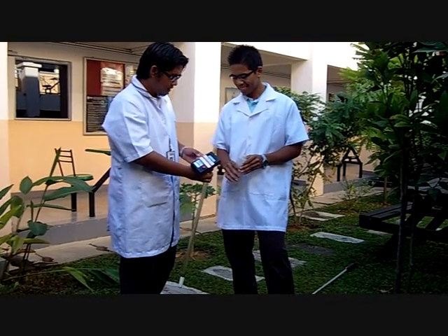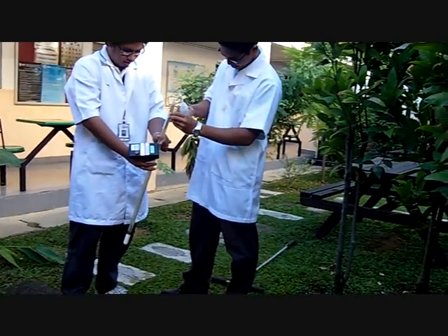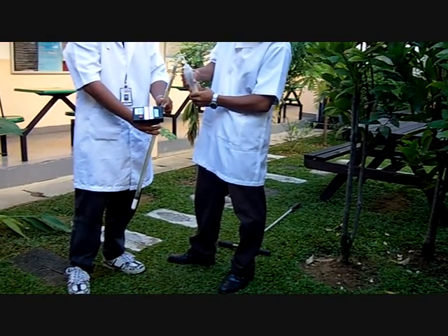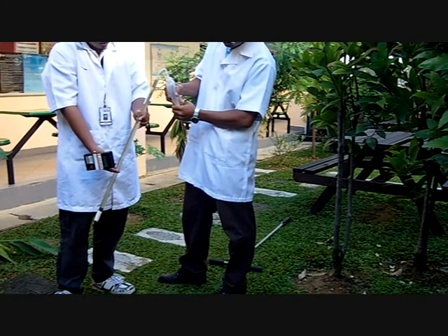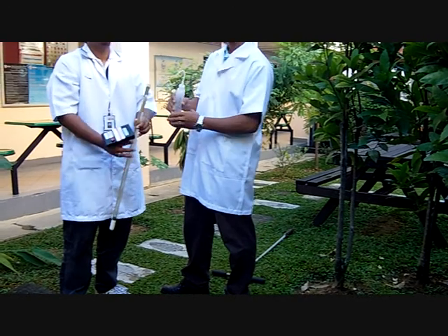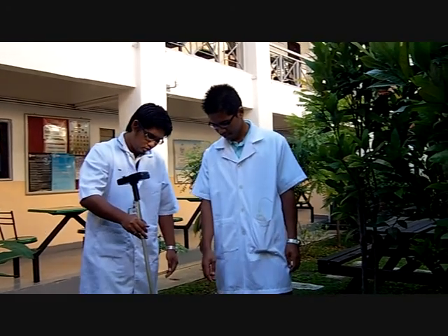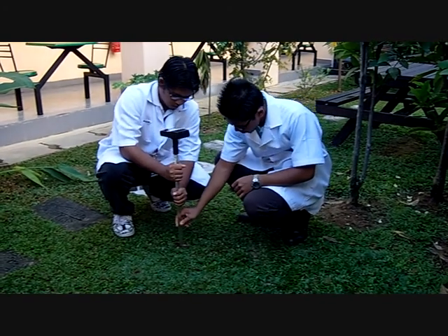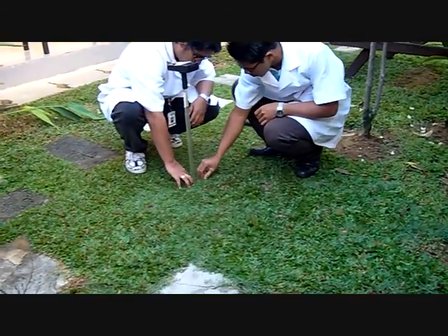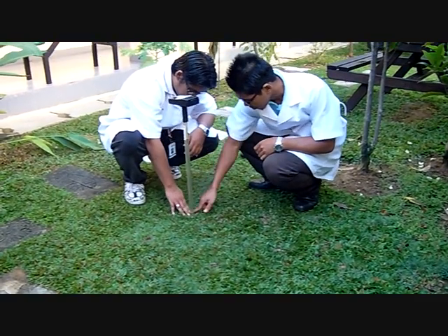Now, fill the tensiometer with distilled water. Put the electrical reading at the electrical tensiometer and dip it into the hole that we made. We must ensure that the tip is fully covered with the soil.